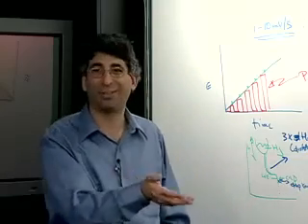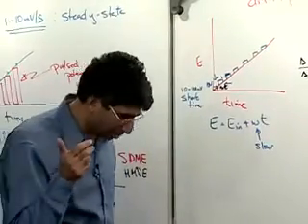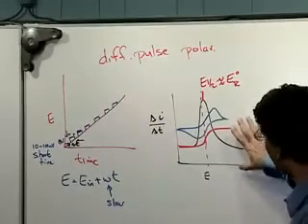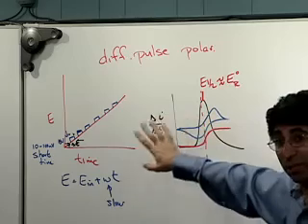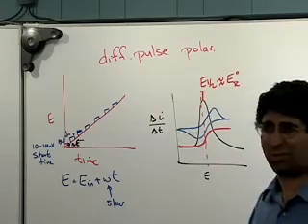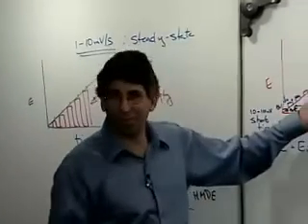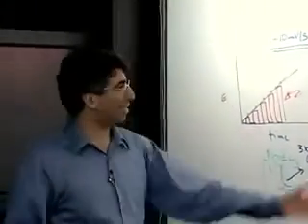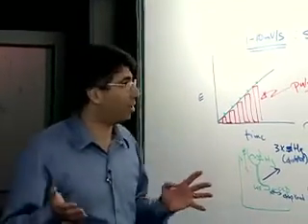Of course, now generating a waveform is not so complicated. Even though there are some nice concepts about getting rid of baseline and sometimes noise and things like that, it doesn't always work, and that's typically why you're doing this. So usually you will just run through these techniques, from an analytical point of view, to use the technique that gives you the best signal. And you cannot sit here and say, oh, this one will always give you the best signal. It doesn't work that way. You would think it should based on what I said, but it looks like a nice, sophisticated technique, but it doesn't. It's also not totally a true statement that all you can use this for is figuring half-wave potentials.